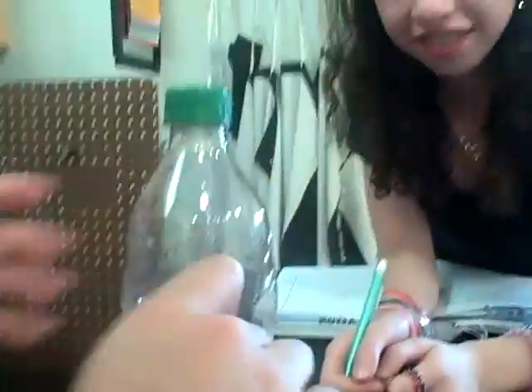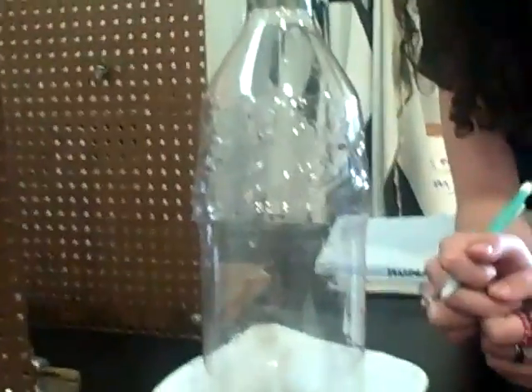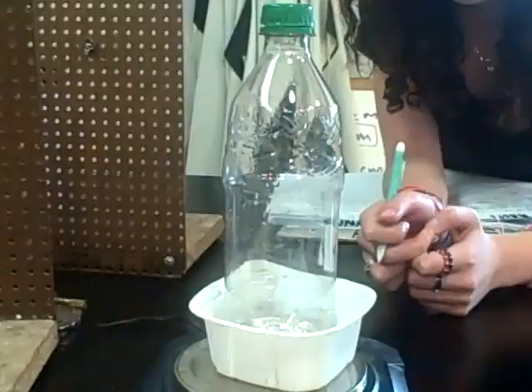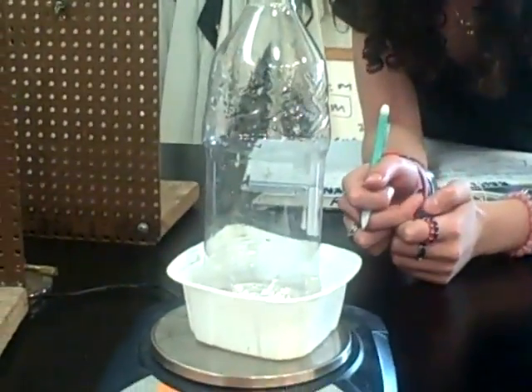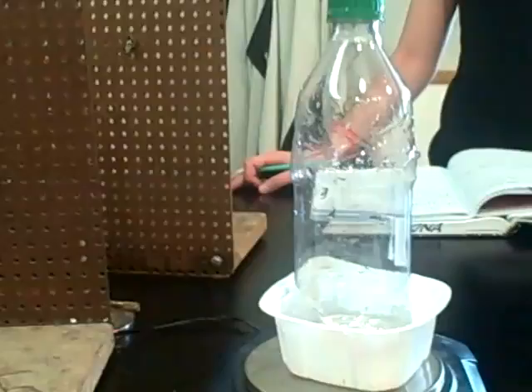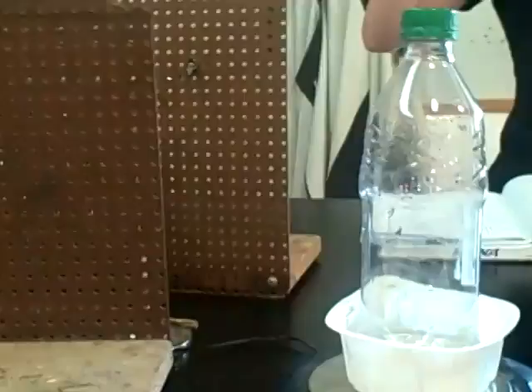What we are going to do now is we're going to weigh. Right now the bottle with the water and no Alka-Seltzer and the cap weighs 107.84 grams. 107.85 grams.